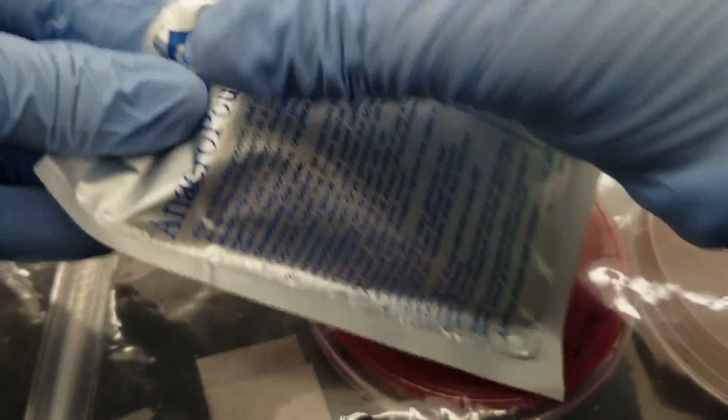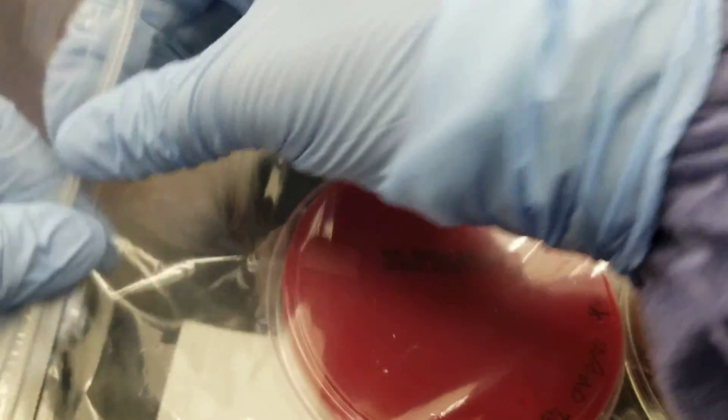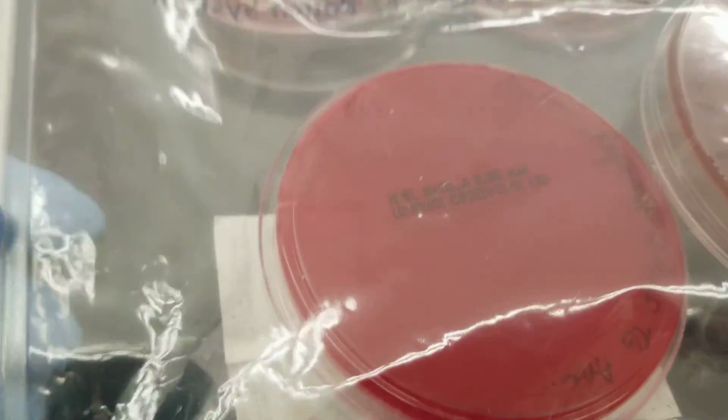You've seen other videos, and I have other videos that you can look at on each of the anaerobic organisms that we have in our classroom and what their testing and growth characteristics should be. So we're closing this up nicely. You want to leave a little bit of air in there so that the gas pack can do its job and change the environment, lower the oxygen, and transform it into a high nitrogen and high hydrogen environment.